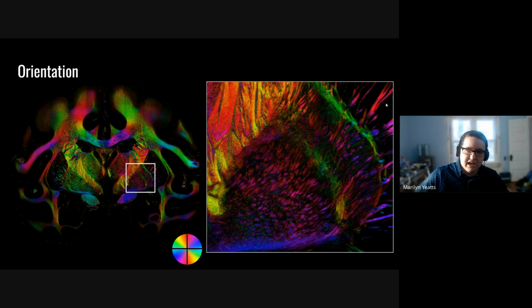Over here, you can see the edge of some Wilson's pencils. And all these orientations are based on this circle. The other great thing about this is these are not estimated orientations. These are measured and calculated orientations based on the actual optical properties of the fibers themselves. So this is that nice, beautiful money shot of a specific zoom in that most people are interested in.